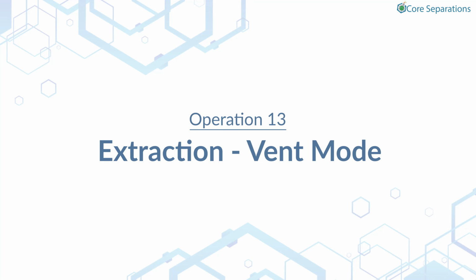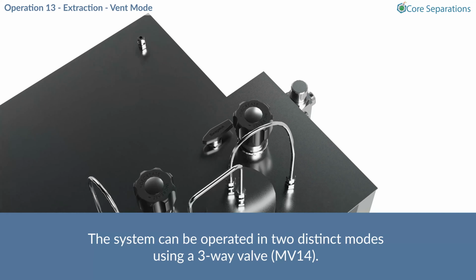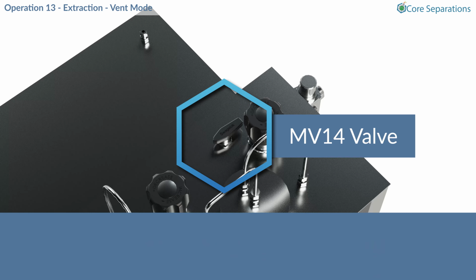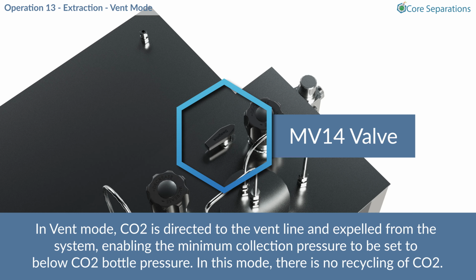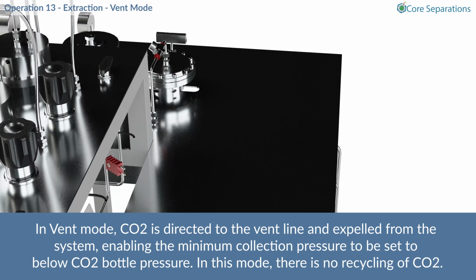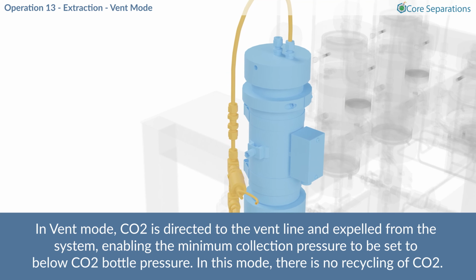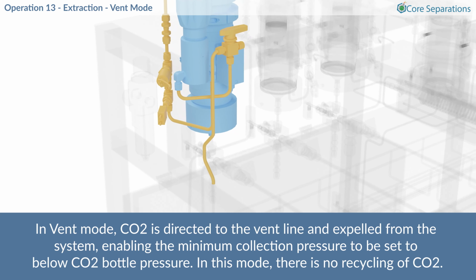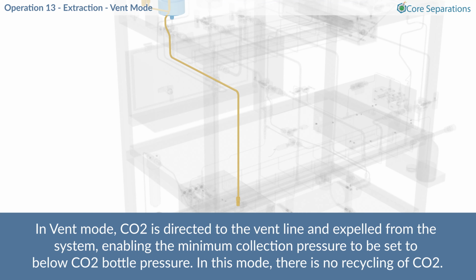Operation 13. Extraction. Vent mode. The system can be operated in two distinct modes using a three-way valve, MV14. In vent mode, CO2 is directed to the vent line and expelled from the system, enabling the minimum collection pressure to be set to below CO2 bottle pressure. In this mode, there is no recycling of CO2.